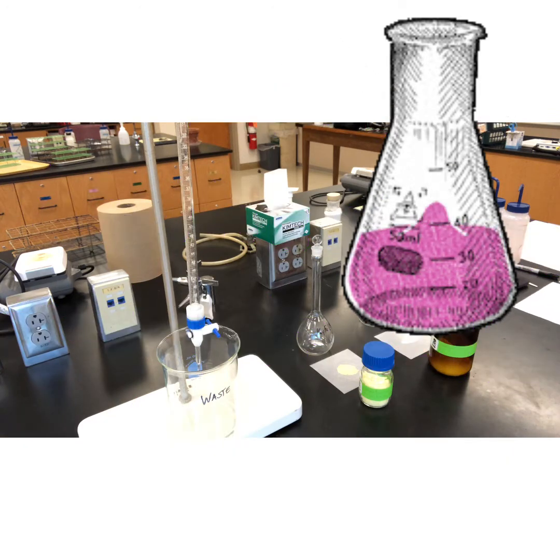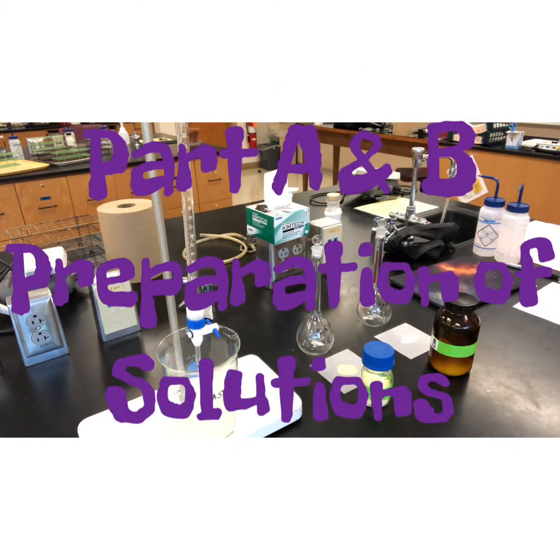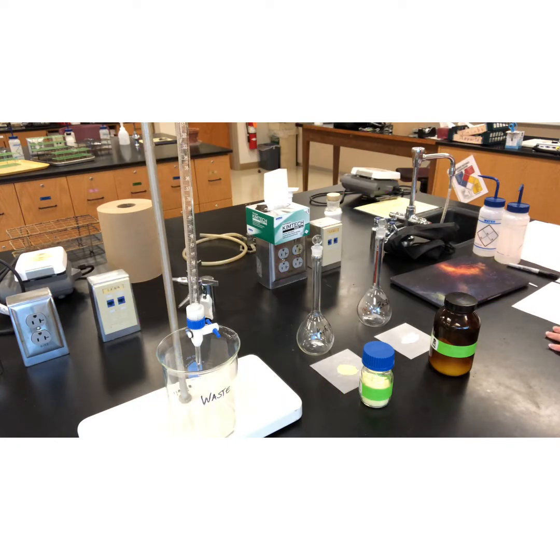All right, so what we're going to do first for Part A and Part B is prepare some standard solutions of potassium ferrocyanide and zinc sulfate. In the pre-lab, you were supposed to calculate the masses of each solid that you would weigh out to create a certain concentration and volume of a particular solution. So we're going to use those masses and create those two solutions.